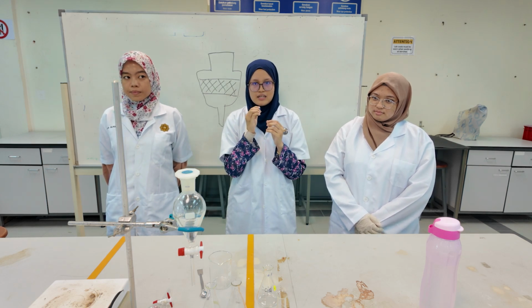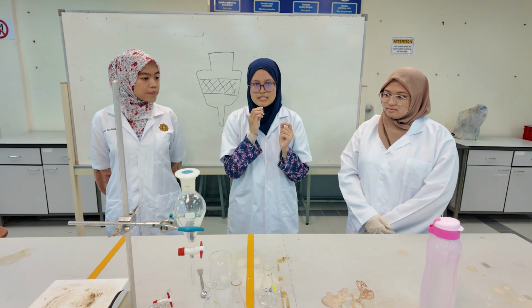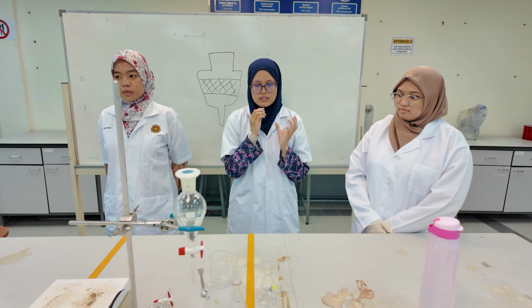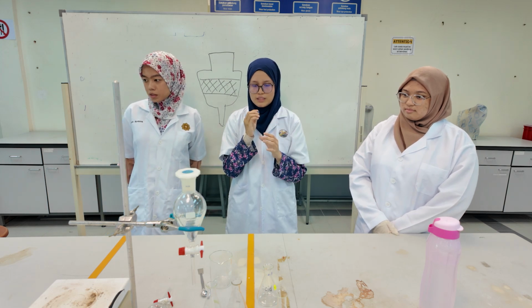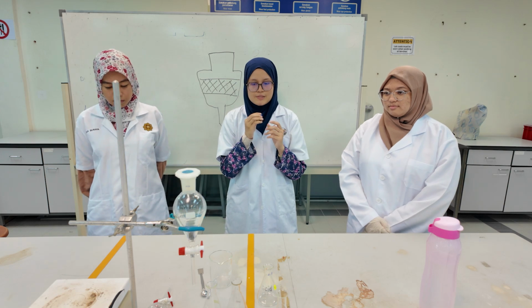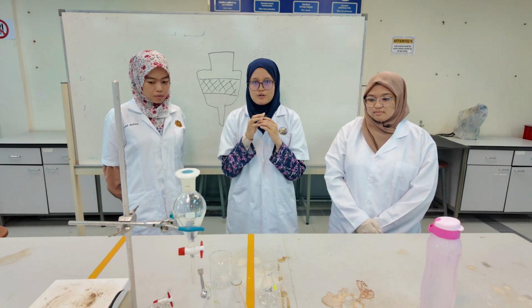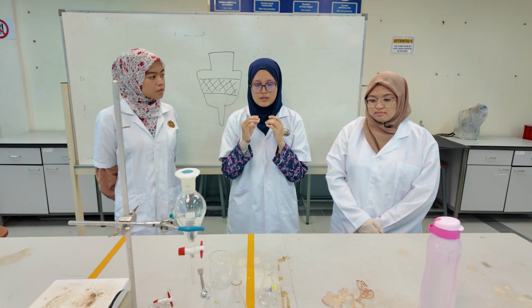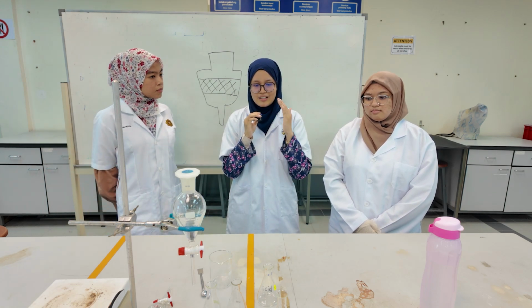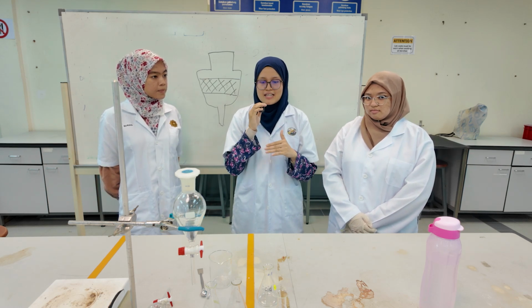For this experiment, the organic solvent we use is dichloromethane, and for the aqueous solution we use water. The important thing that we need to remember is dichloromethane is denser than water. So the dichloromethane will be at the bottom of the layer and the water will be on the top of the layer.